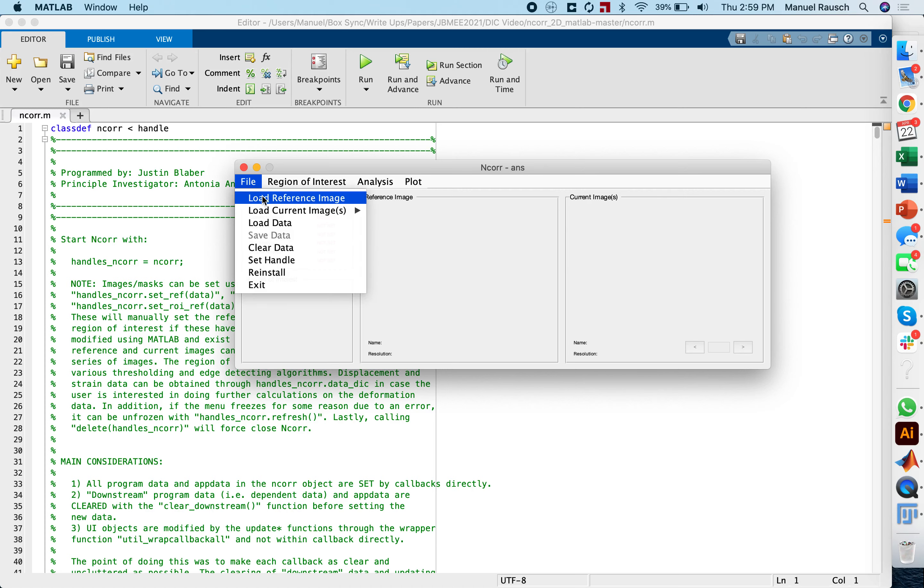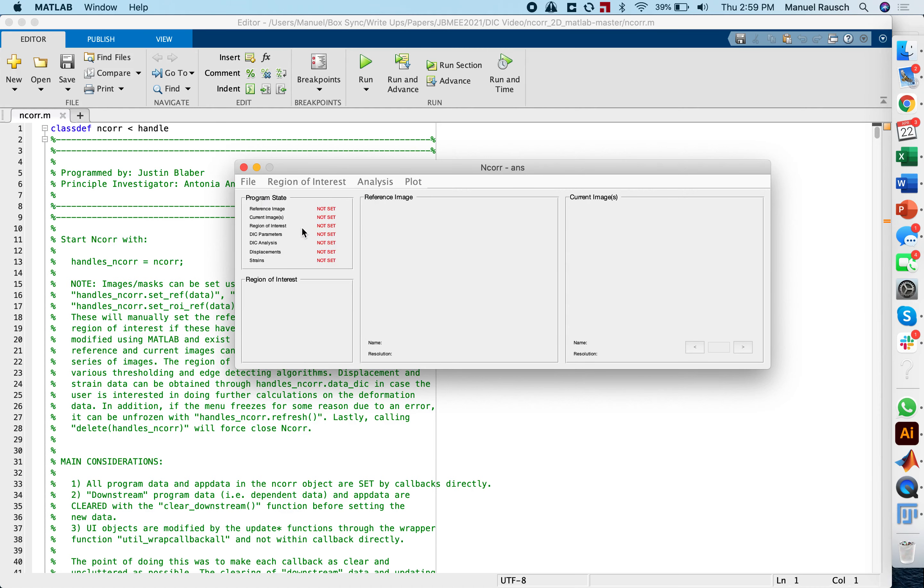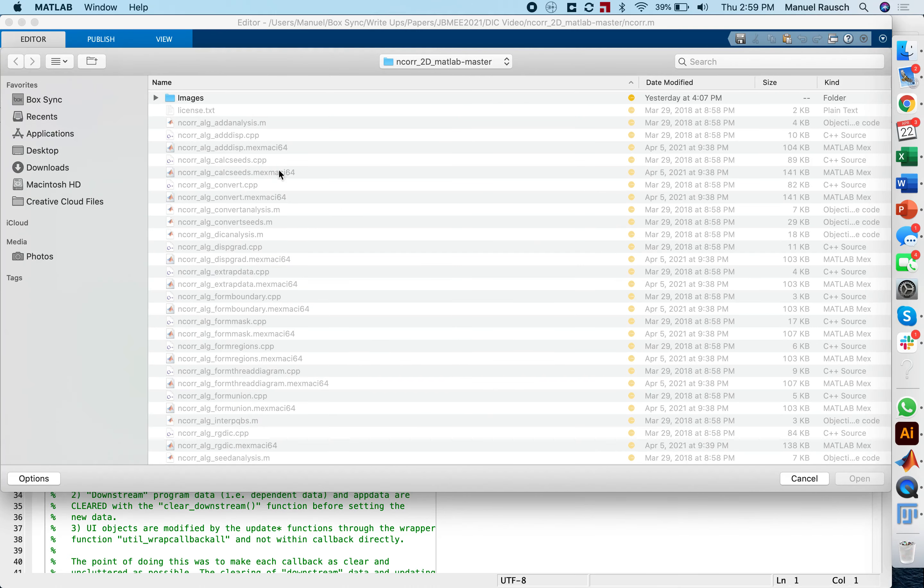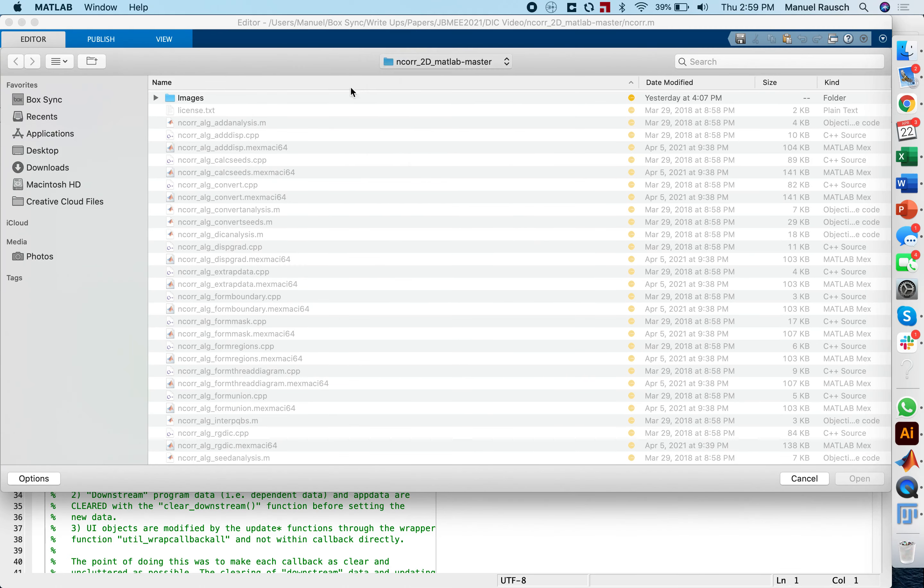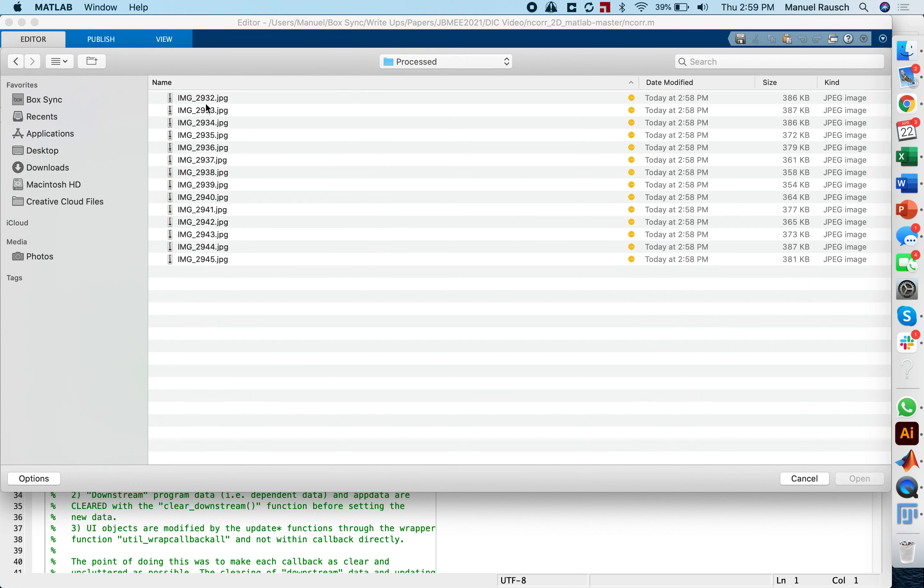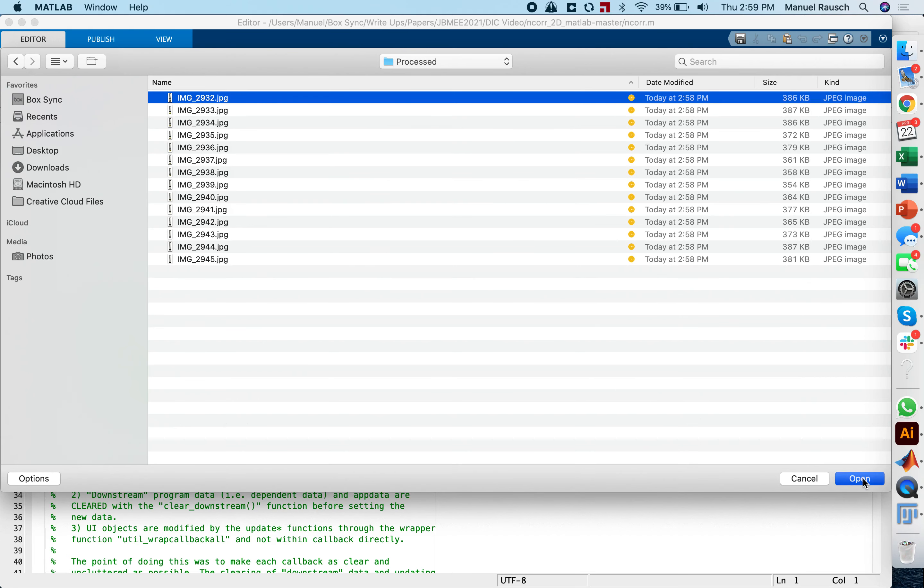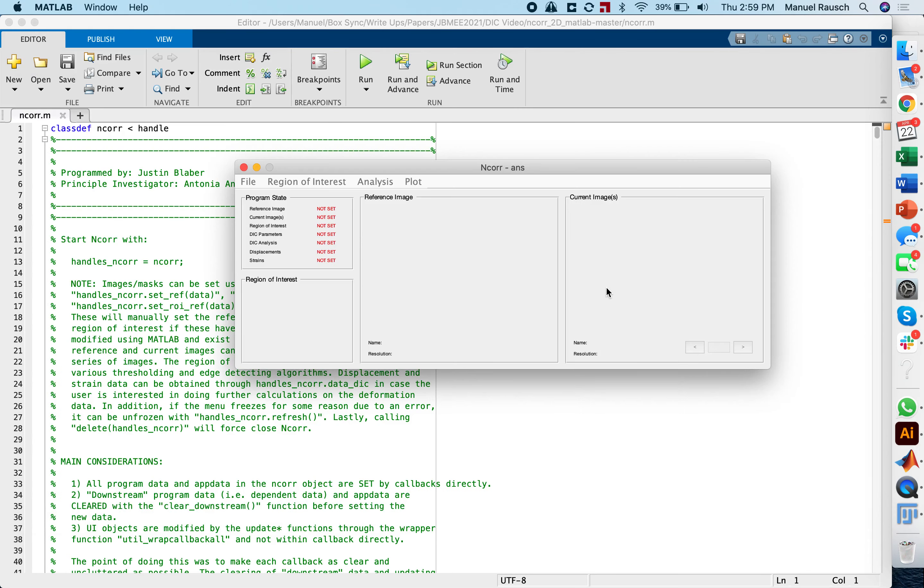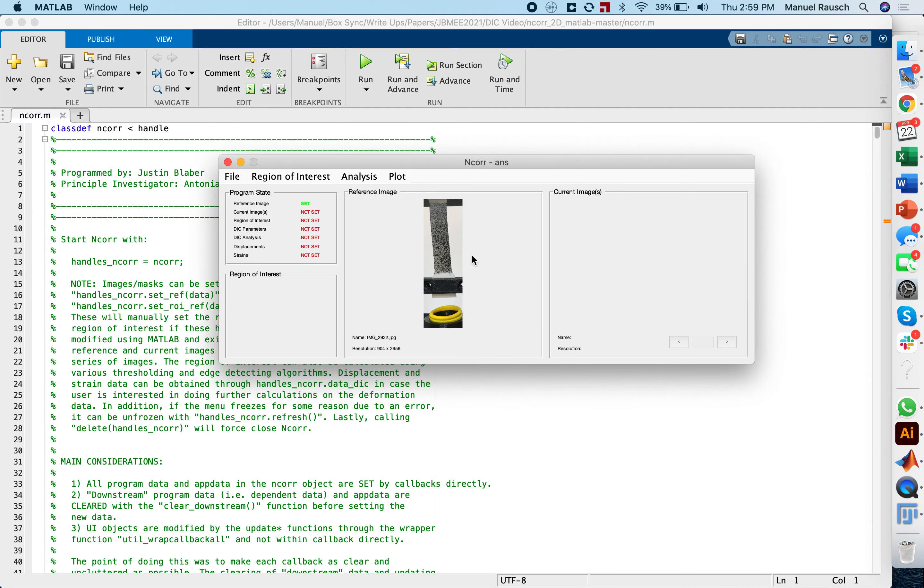The first step is you click on file and load reference image. We're going to actually go to our folder with the processed images and we're going to select our reference image. This is not a super fast process of loading, so it makes sense to crop these images. Here on the side, you see the program stage in which we now have a green light on the reference image.